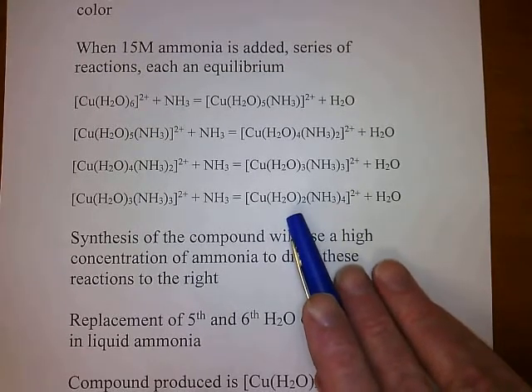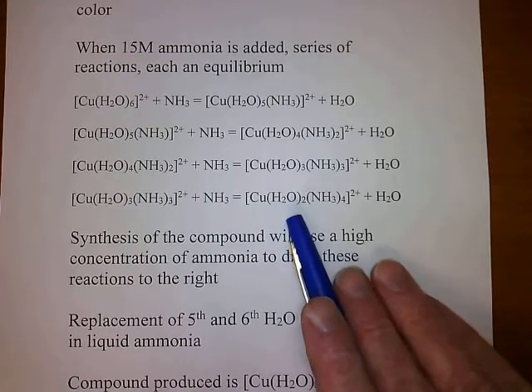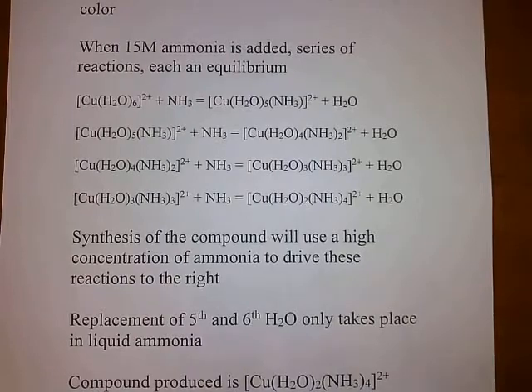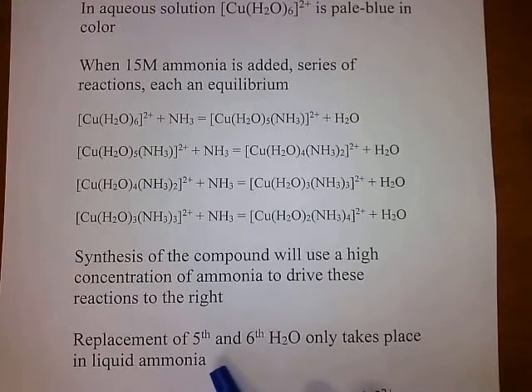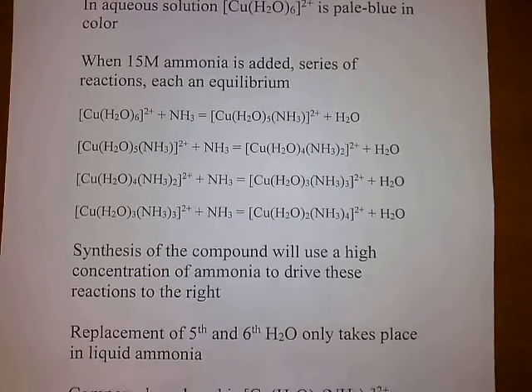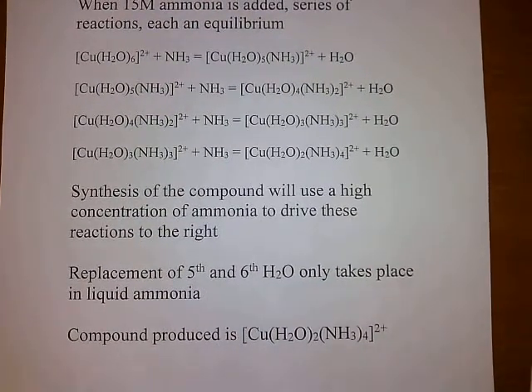Copper likes to hang on to two of those water molecules. The replacement of the fifth and sixth water molecules would only take place in liquid ammonia. That is liquefied ammonia, not ammonia dissolved in water. So the ammonia concentration would have to be higher than what we can get in aqueous solution. So ultimately the compound that's produced is the tetraammine.